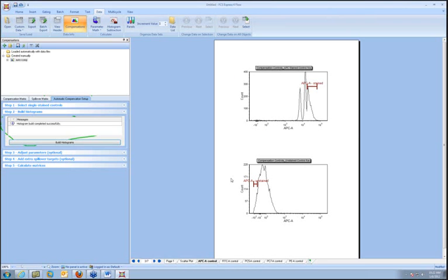Sometimes the clustering doesn't always work, as it doesn't in the negative control here. It is actually working, it's just somewhat sensitive to noise, and it detected that this little peak at the bottom was actually its own cluster. So we just have to widen that a little bit to say this is what we want to use for the negatives. So you just flip through all of your plots. You can see that this one, it actually did fairly well. We don't have to make any adjustments.